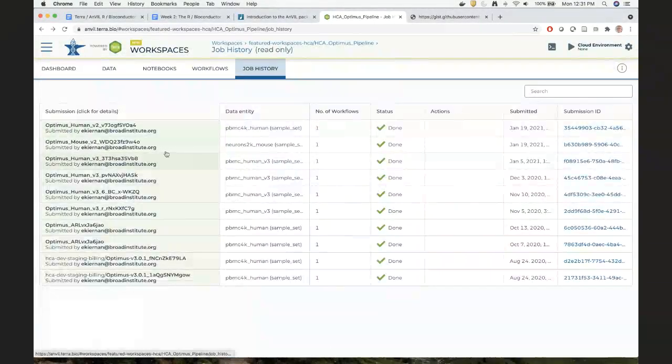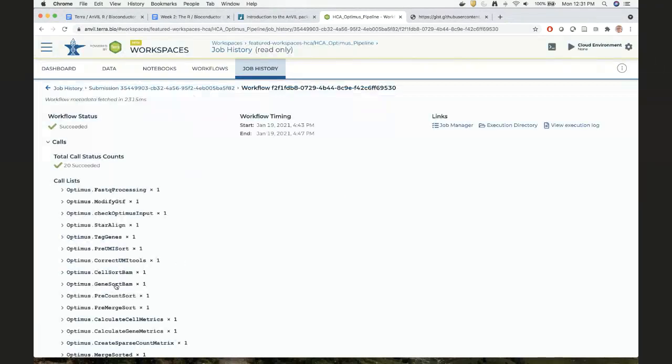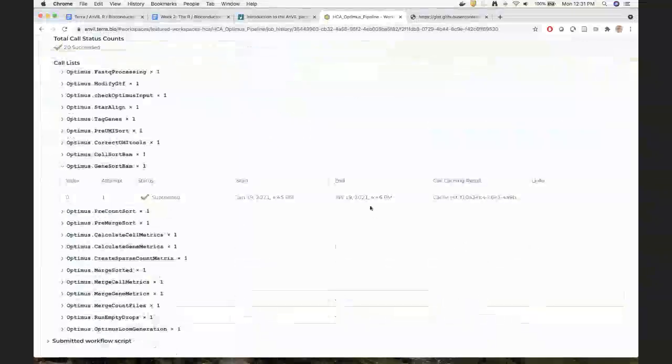And so you'd drill down here. There would be a green check. There would be a red X, and the red X would say, oh, I got through 7 steps, and then something terrible went wrong at this stage here. And then there'd be links to the output, and you could determine what was going wrong with your script.